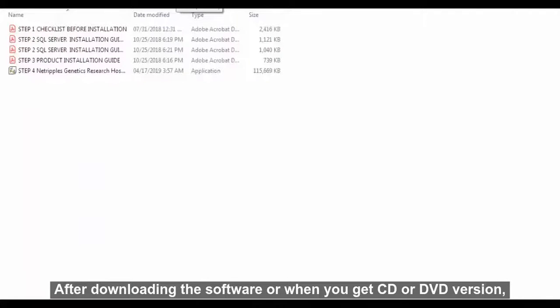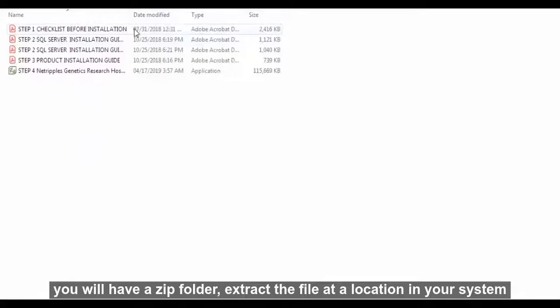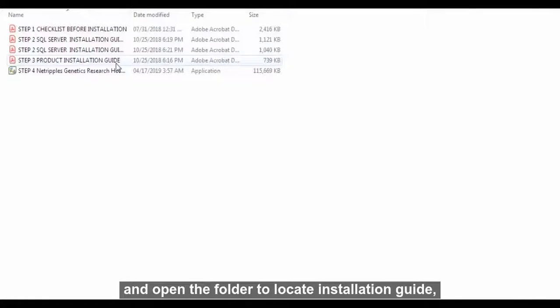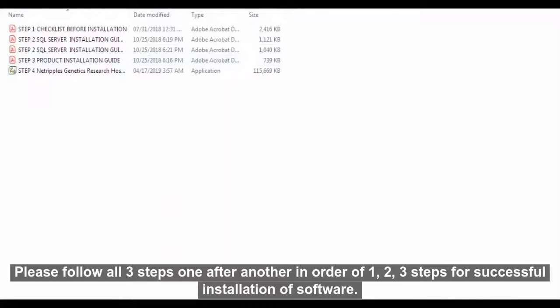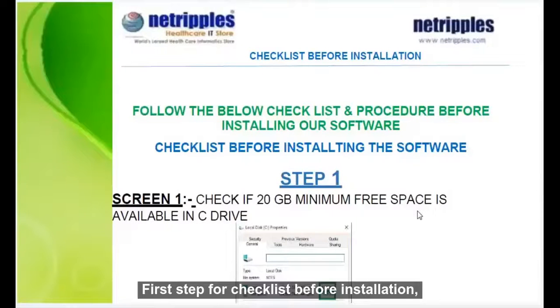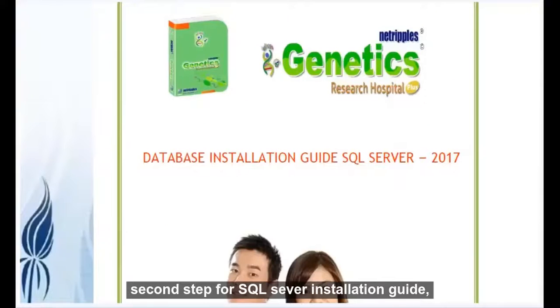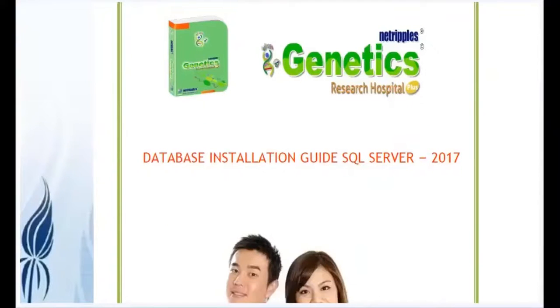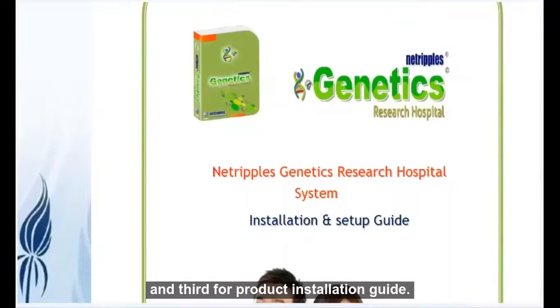After downloading the software, or when you receive the CD or DVD version, you will have a zip folder. Extract the file to a location on your system and open the folder to locate the installation guide. Please follow all three steps in order — step 1, 2, and 3 — for successful installation. Step 1 is the checklist before installation. Step 2 is the SQL Server Installation Guide.